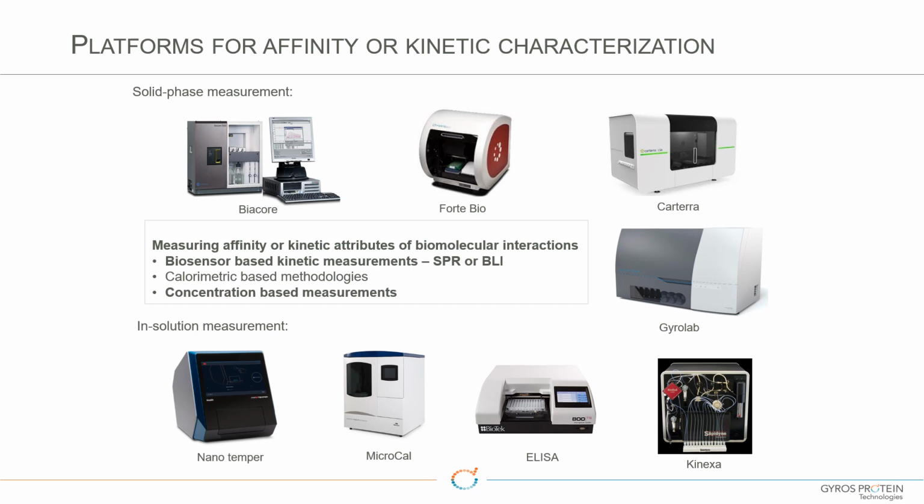The Gyros, along with a number of other options, can be used for in-solution measurement. In-solution is really a classical way of doing affinity, and classically would be done with an ELISA assay in a plate. Again, in solution gives you the option of measuring things without having to necessarily label your interactants.